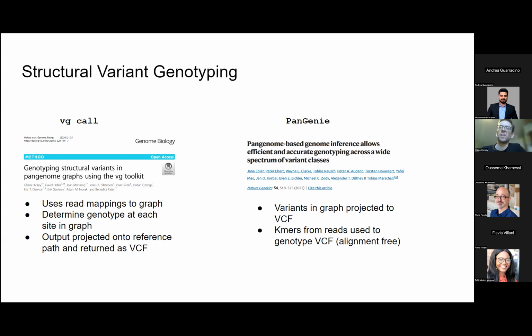You want it to have as much diversity within the samples as you can, but not so much that you can't use it as a reference with current tools. In terms of pangenome graphs, we've moved from the old way of making them from variant calls, from short read data on the reference genome, to really just the past couple of years moving to this paradigm of going straight from the assemblies into multiple genome alignments. And we're seeing a lot of improvements across the board by doing so, but many challenges remain, as you'll see when you actually try to use any of these tools. Next slide.